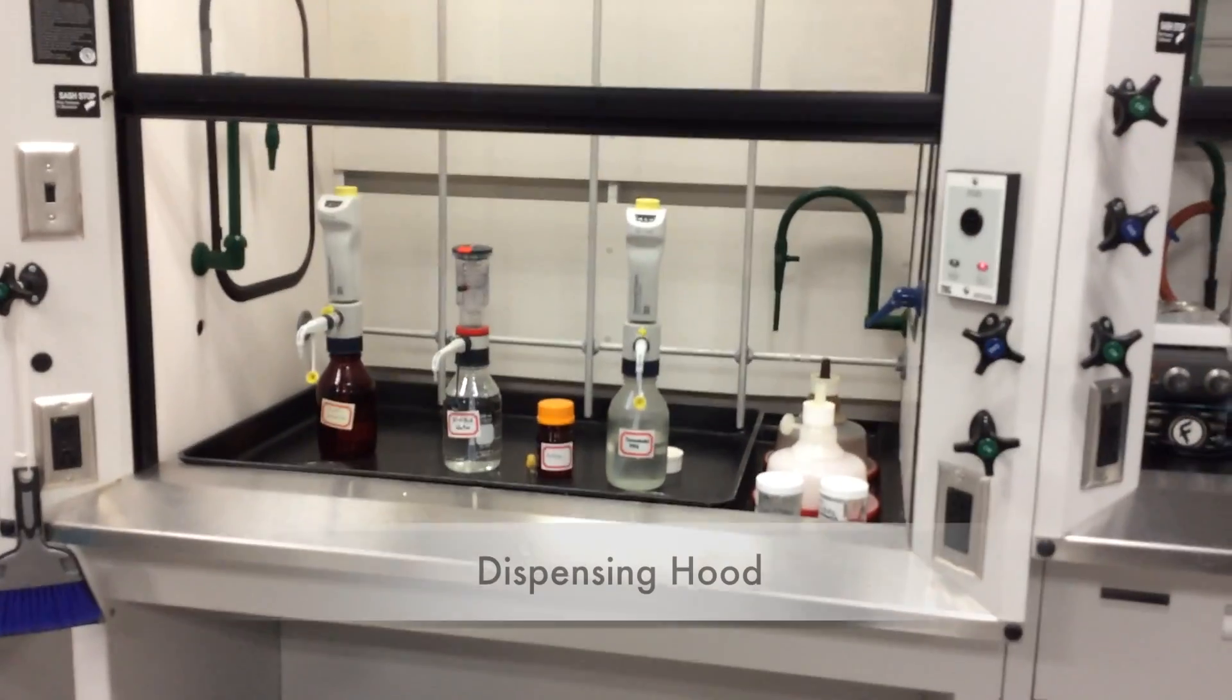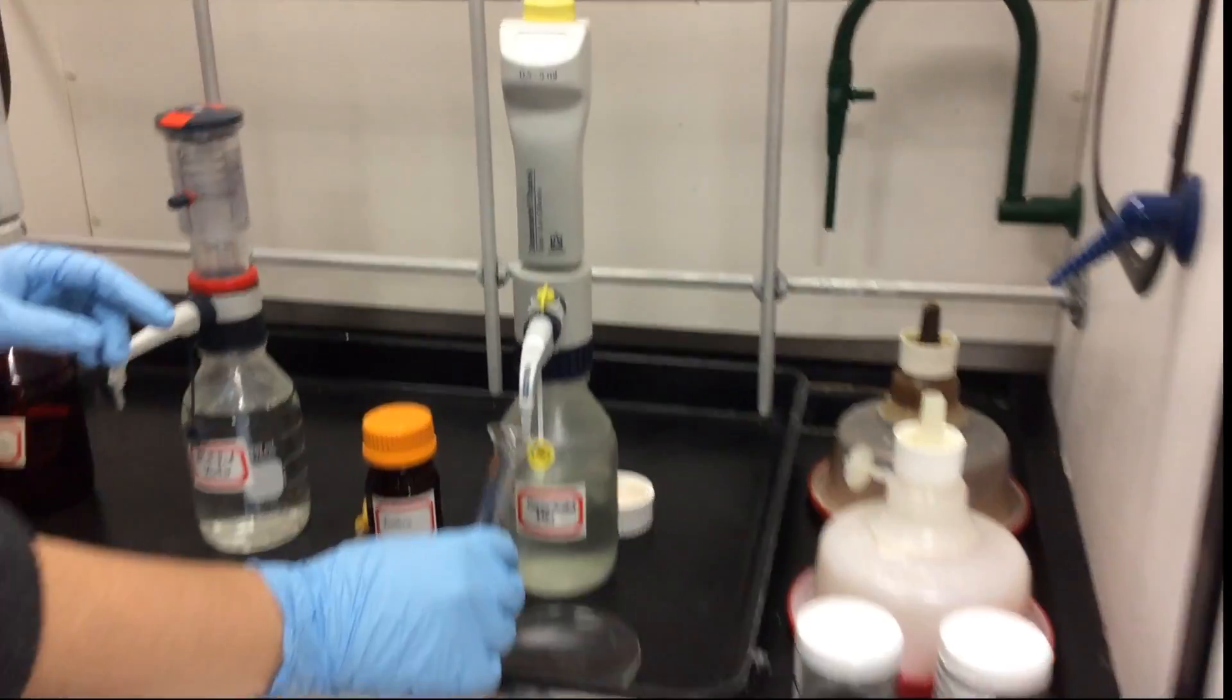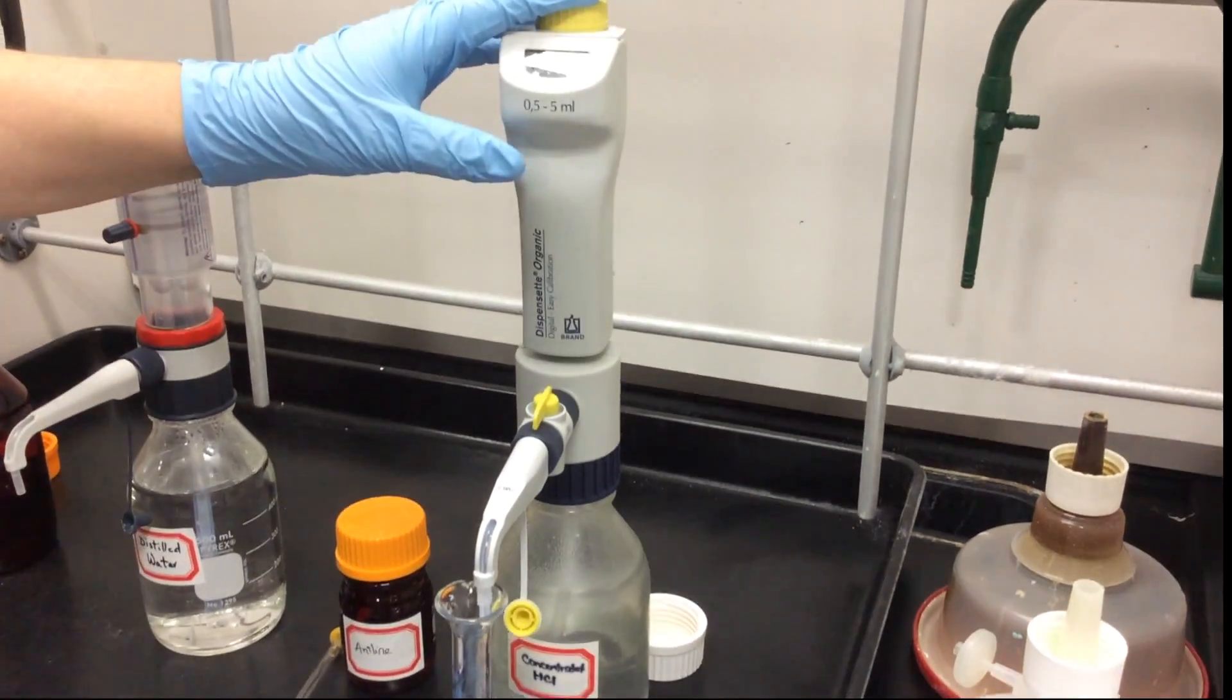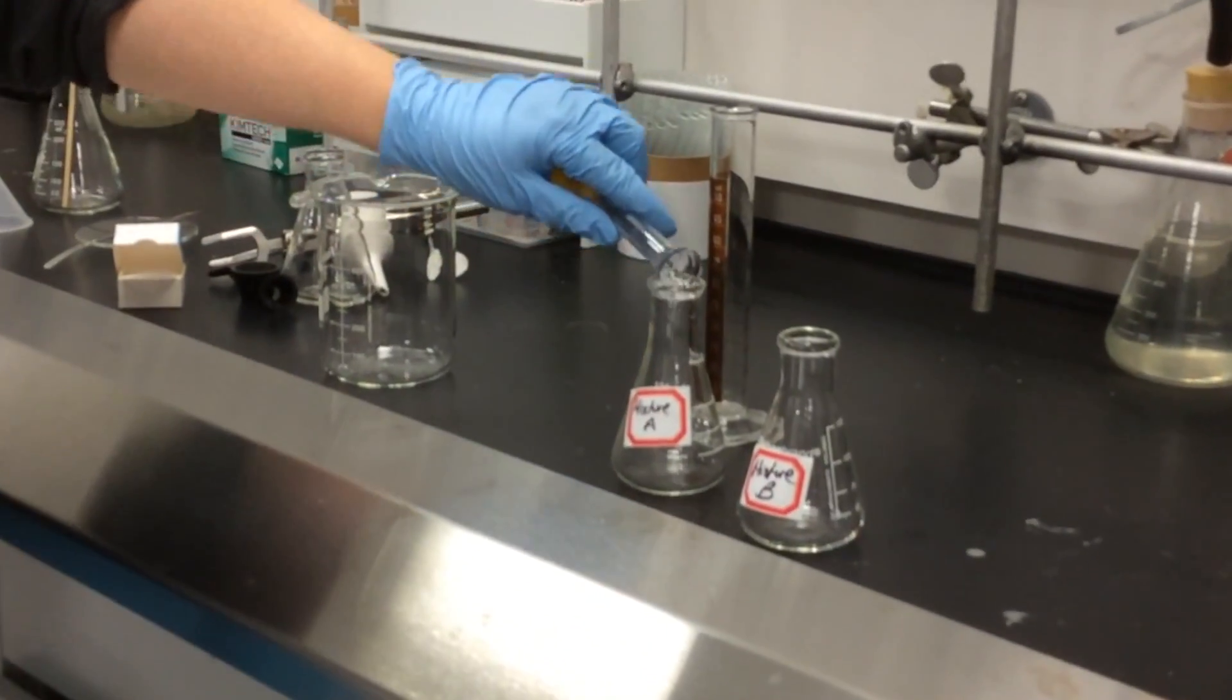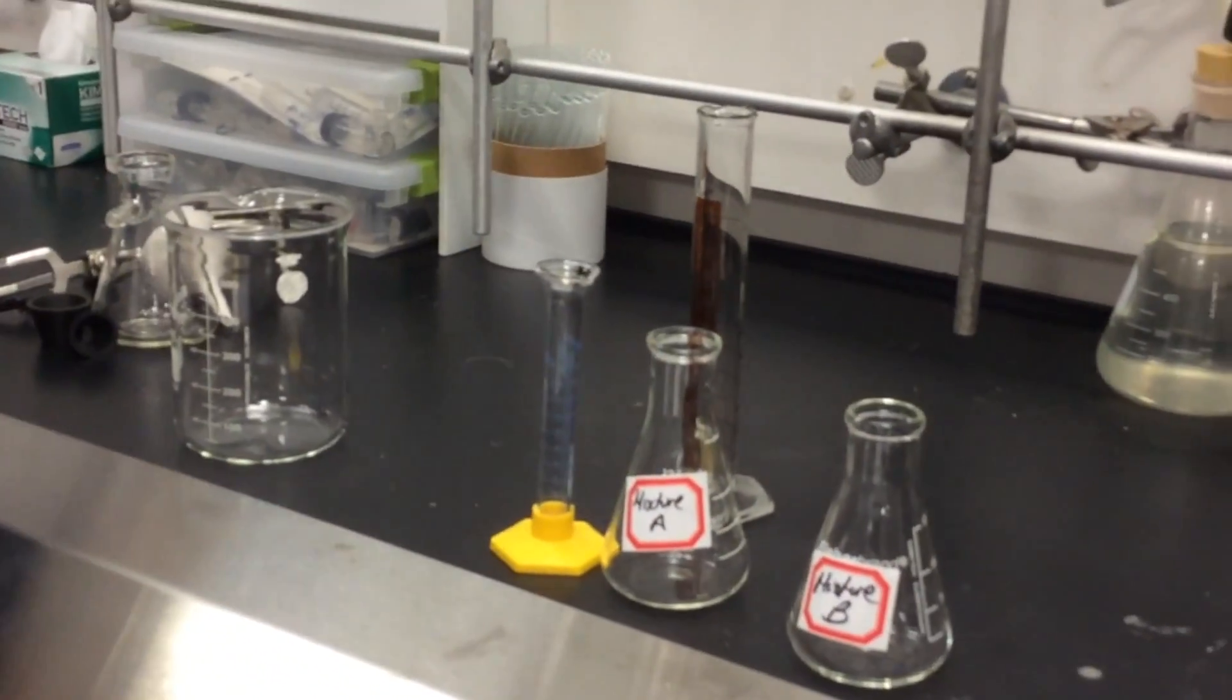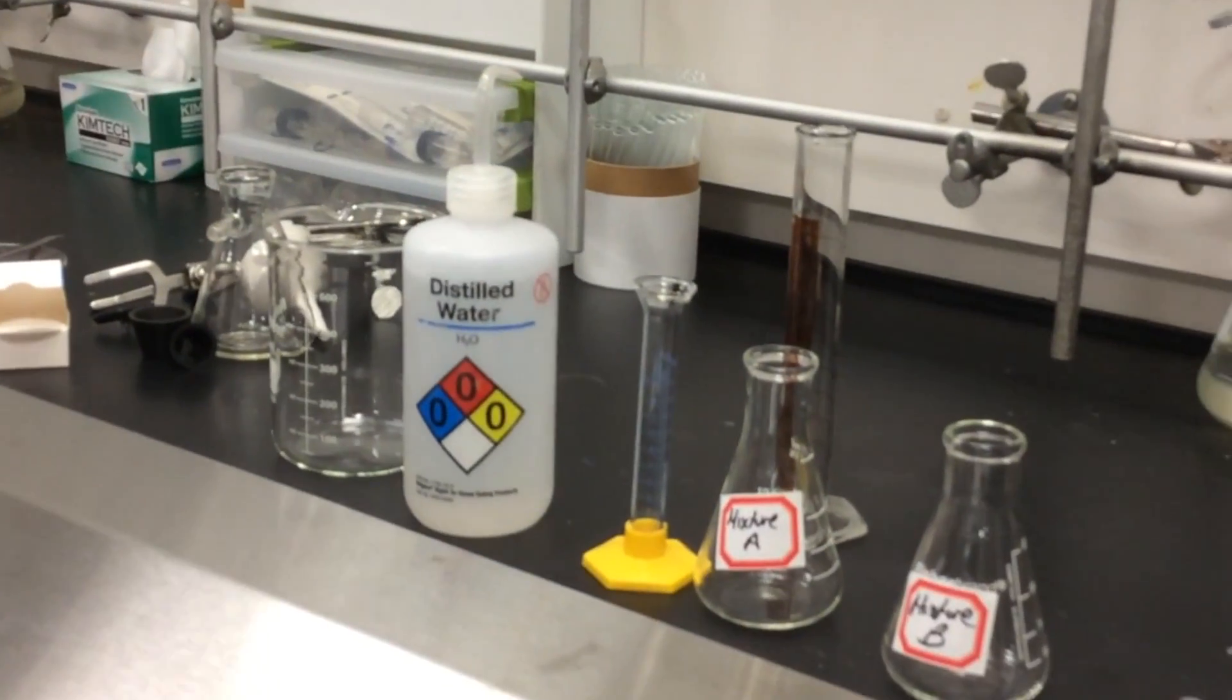This is the dispensing hood. All the liquids will be found here. We're going to take two milliliters of concentrated HCl, just pull the pump up and push it down. Now it's in your graduated cylinder, and then pour it into the 125 milliliter Erlenmeyer labeled mixture A.